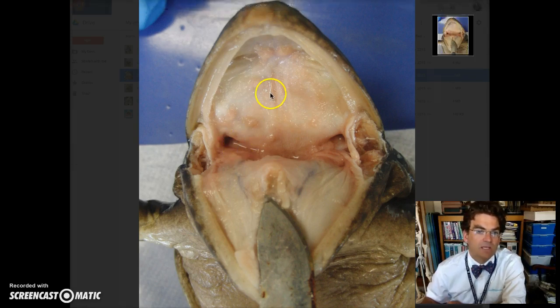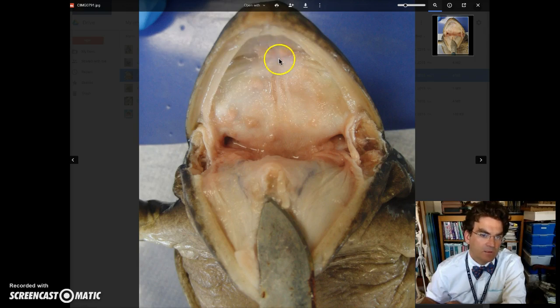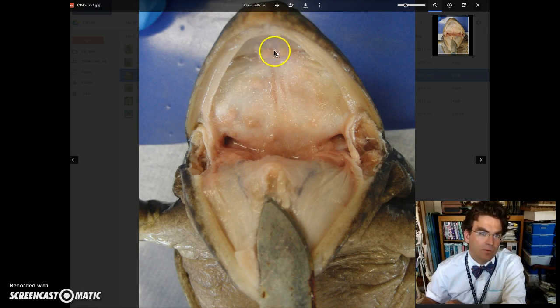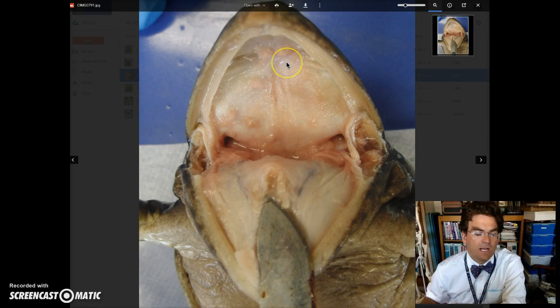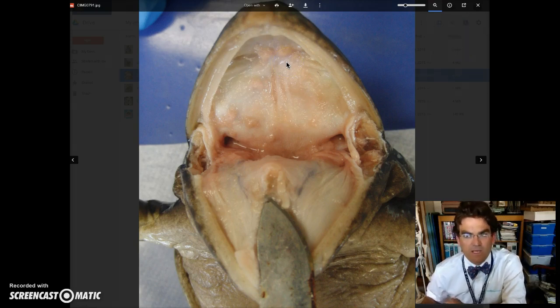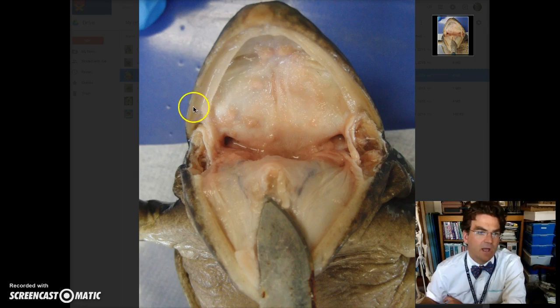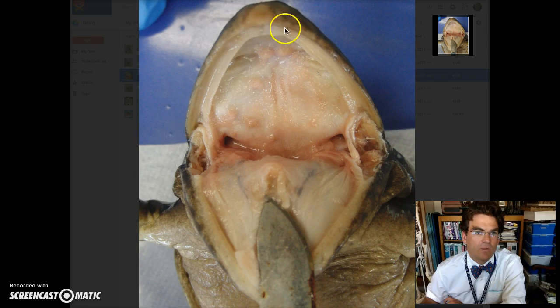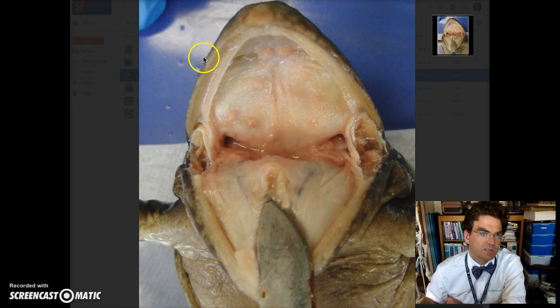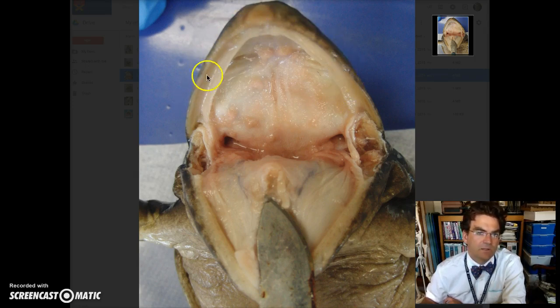Next, we've got the vomerine teeth, and they are right up here. These are fairly sharp in nature — they kind of help hold that food in place for the frog. There's one right here and then one right there. And then there's also the maxillary teeth, and the maxillary teeth really are along the entire upper jaw. You could have rubbed your fingers along his upper jaw to feel those small, tiny teeth — it kind of feels like sandpaper. These are the maxillary teeth.